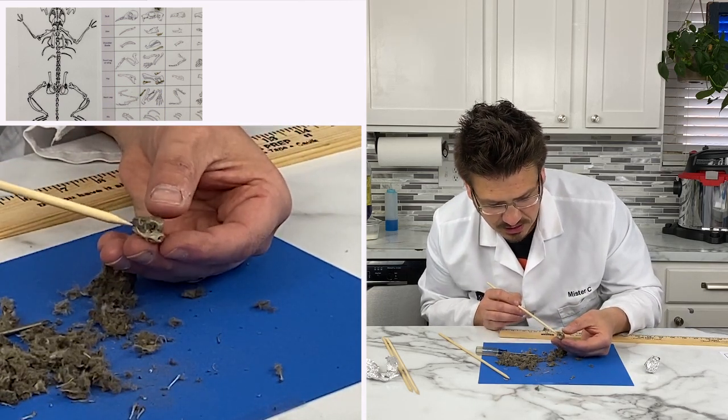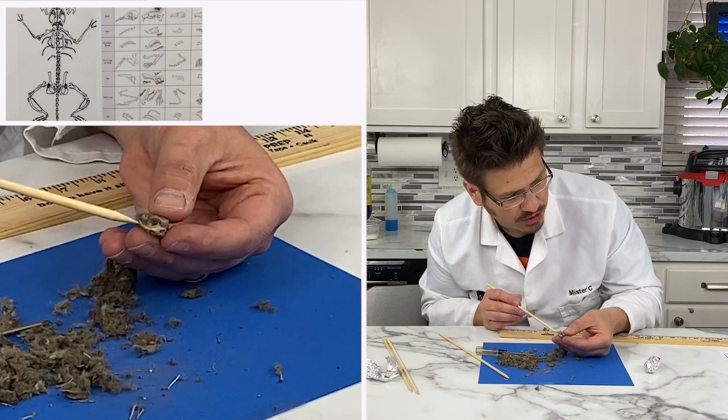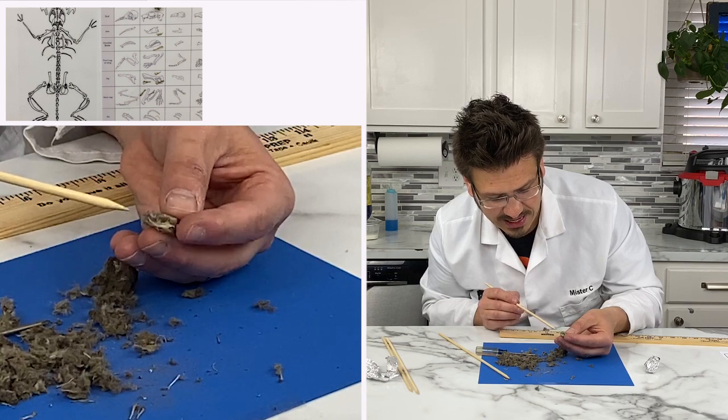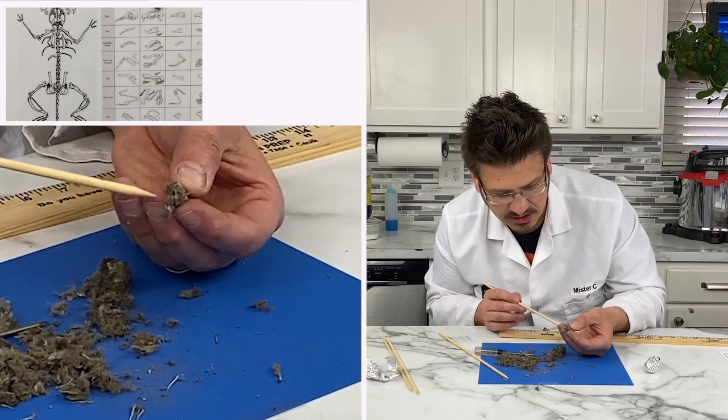There's our skull. I'm going to try to get some of this fur out of the face here. There is the lower jaw. Here's our upper part. Here is what would be the eye cavity. I'm going to turn this around. Oh my gosh, that is so cool.